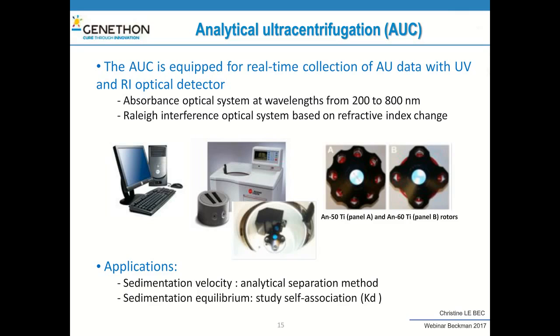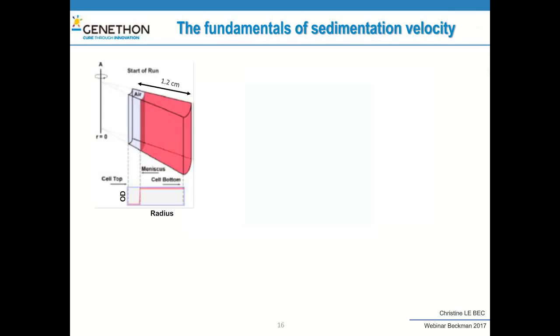We apply sedimentation velocity to separate full and empty particles. At the beginning of the run, you have a homogeneous signal from the meniscus to the bottom.